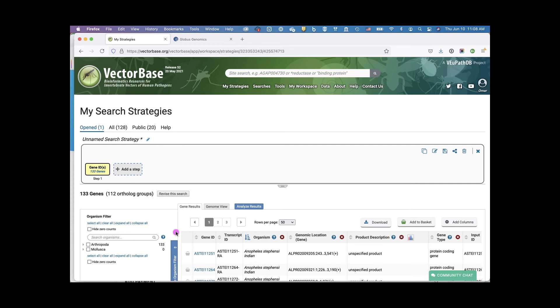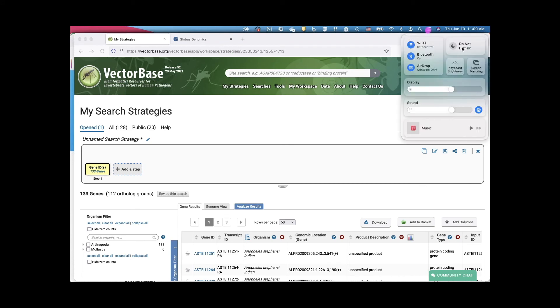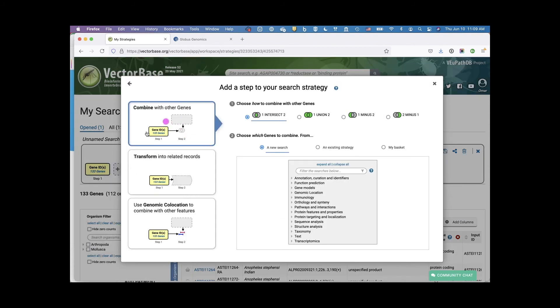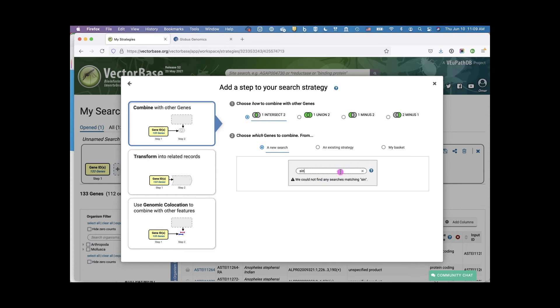One thing to be aware of is that if the gene annotation itself changes, it's possible that some gene IDs become obsolete or get merged with another one. So if you had 150 gene IDs in your list but only come back with 140, there are 10 missing — most likely due to an annotation issue. Definitely contact us if you run into issues like that and we can help you. You can analyze your data in different ways by adding steps. For example, I can ask how many of my genes have a predicted secretory signal peptide by combining this with another search.